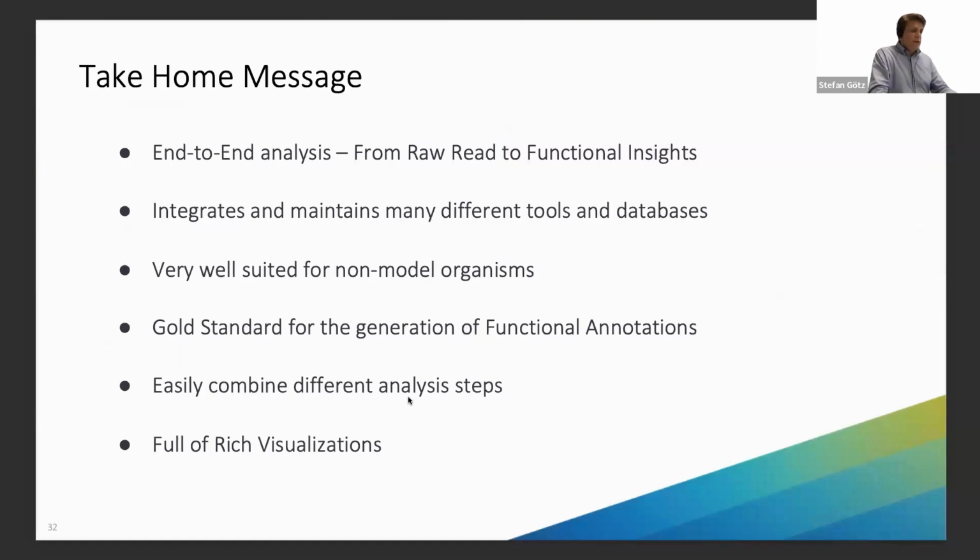Okay, so I think the most important take-home message today, which I wanted for you to know, is that we managed, within this setup, to get from just a couple of FASTQ files, from raw reads, to a defined transcriptome, to the functional annotation of those transcripts, and then into the functional analysis and interpretation of my experimental design and of the experimental data. So I could really get from end to end, from raw reads to functional insights for a non-model organism where they had no reference genome, no reference annotations within this setting.